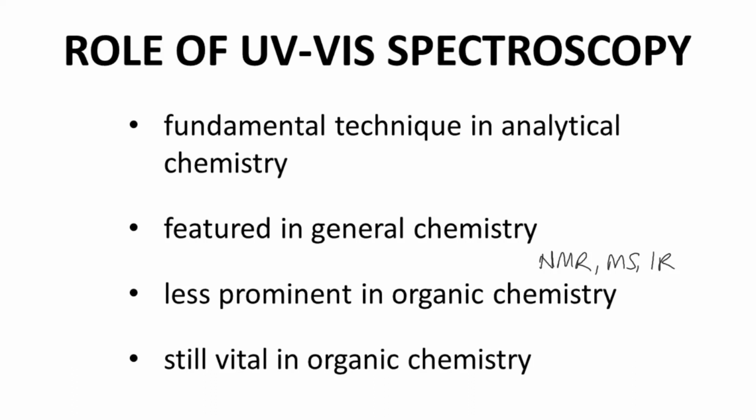It's a bit like automobiles. There are different ways to interact with automobiles. Maybe you can drive a car, maybe you cannot. Regardless, everyone depends on automobiles. Even if you only walk everywhere, things like your mail and deliveries to your grocery store require vehicles. Perhaps your online deliveries arrive by vehicles. UV-VIS, particularly UV spectroscopy, is much the same way. Organic chemists may not think they rely on UV spectroscopy, but it's often vital in less obvious ways.